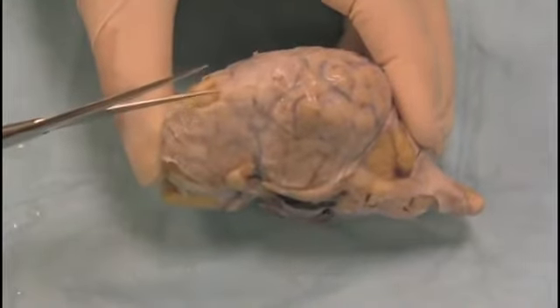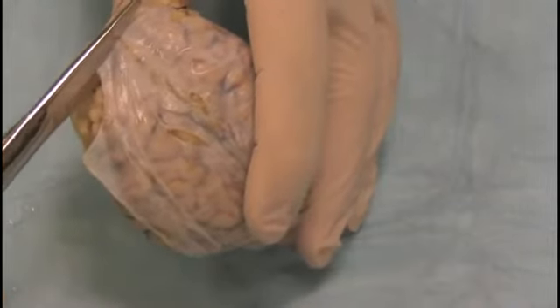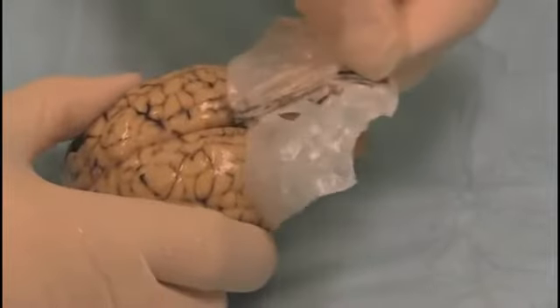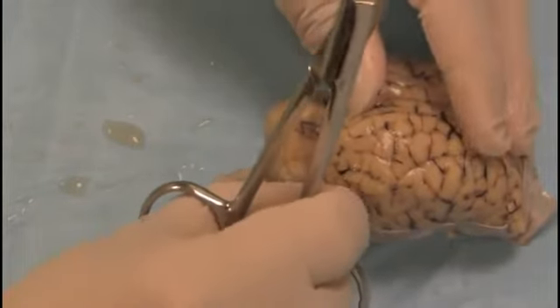The membrane is much more tightly attached to the underside of the brain, so we're going to start off by removing it from the top. We take our sharp scissors, and keeping the point up, we cut the brain around the top surface — like this, across here, and back here. We didn't film taking all of the covering off because it took quite a while. You should take time to do it properly.